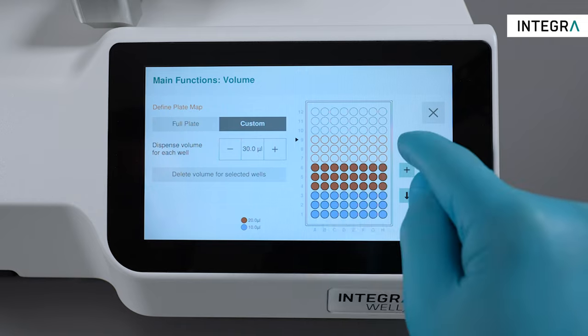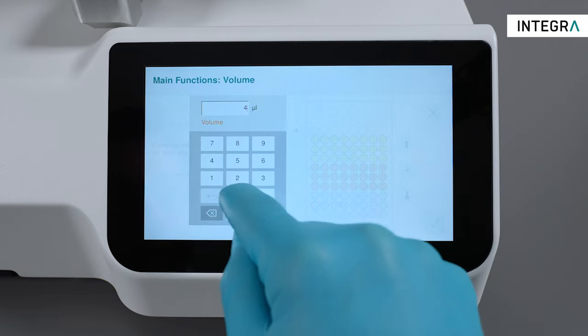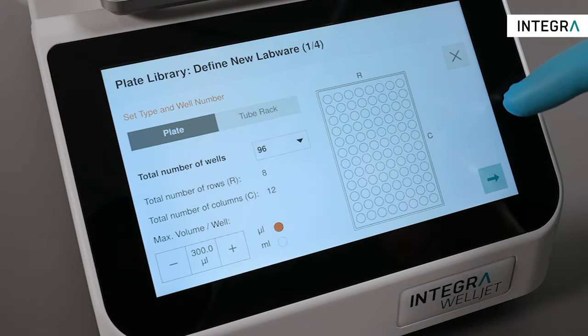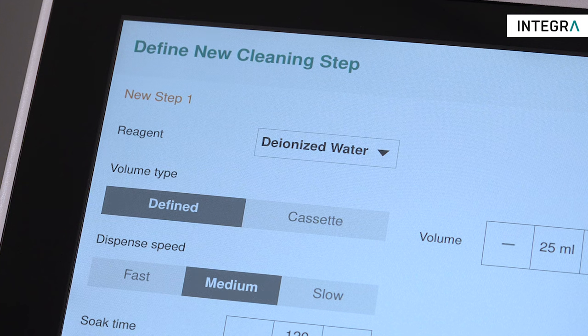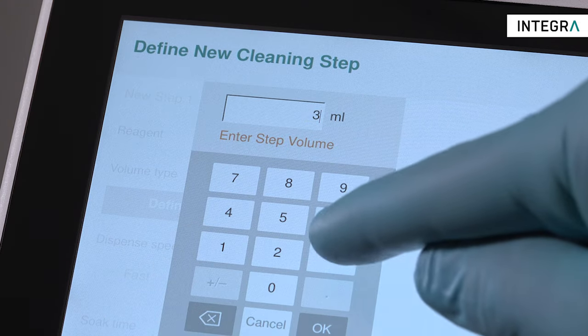The large, high-resolution user interface allows easy navigation through the menu. Dispense programs can be easily defined, and a plate library guarantees that your plates are well organized and searchable. In addition, cleaning programs can be easily defined to keep your dispensing cassettes clean and optimized for use.